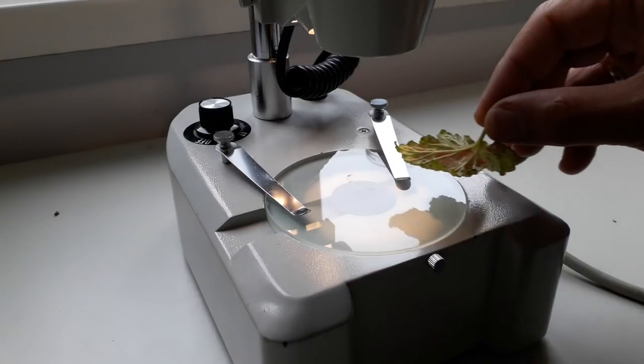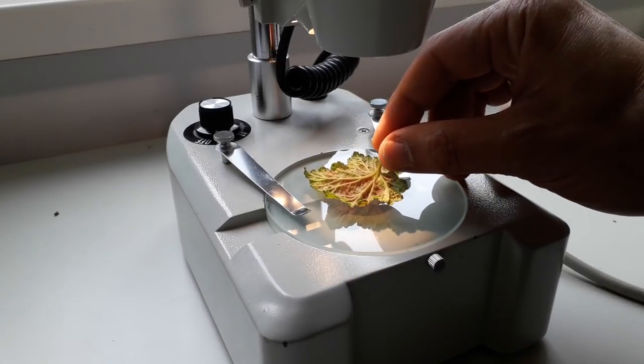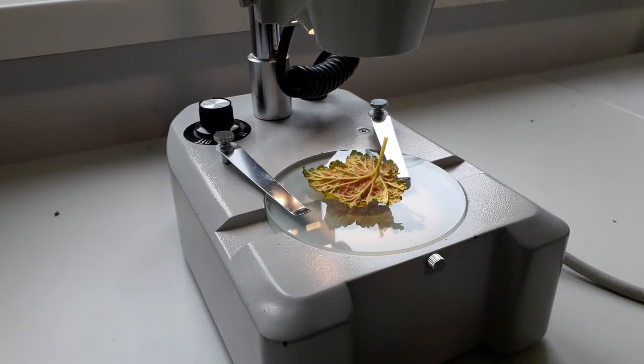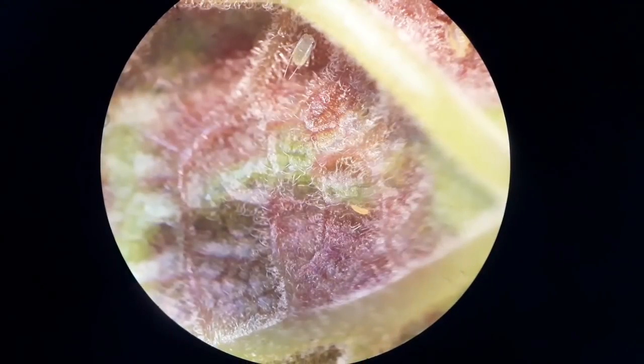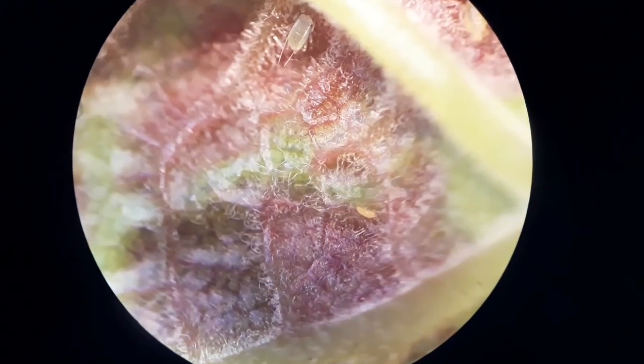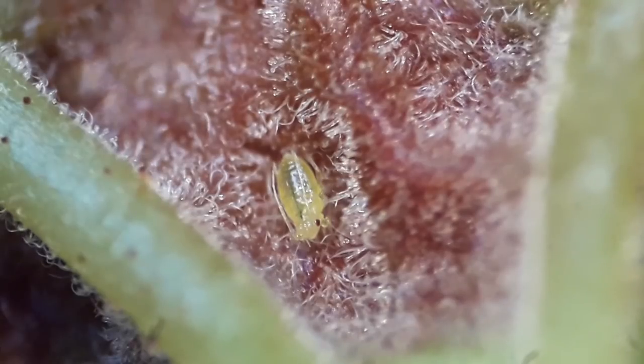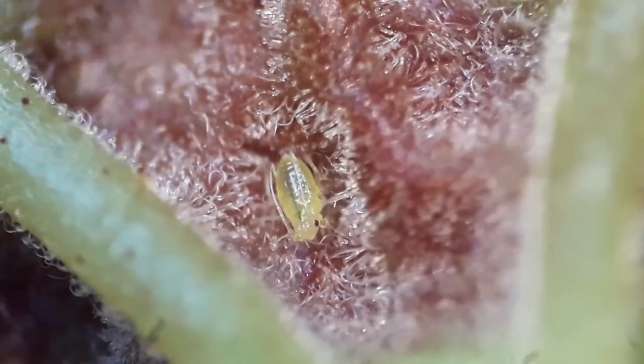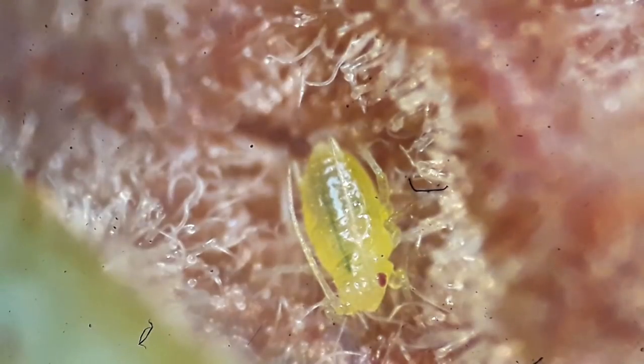Back at home, the leaf goes under the stereo microscope. Sure enough, on the top there is one aphid sitting, and in the lower right corner there seems to be a small one — maybe it's a larva. It's moving a little bit. At 25 times magnification, this is an aphid sitting there.